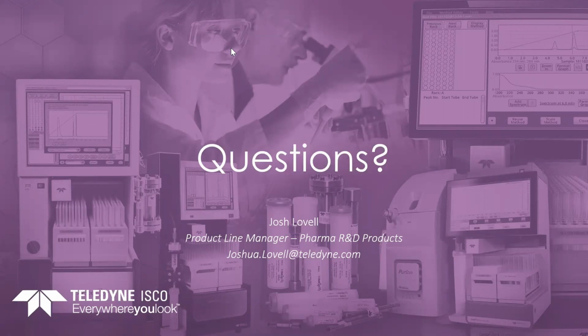Another question here is, what do we mean by the weak solvent? Since the system's used both in normal and reverse phase, in normal phase separations, traditionally our weak solvent is something like hexane, or it's going to be the non-polar solvent, and our strong solvent is going to be a polar or more polar solvent. Now, when we get into reverse phase, we're using water as our weak solvent, and then our organic modifier would be our stronger solvent. So that's what we mean by weak solvent. It just depends on whether you're doing normal phase or reverse phase, but the same principles apply as you increase solvent strength throughout the run.